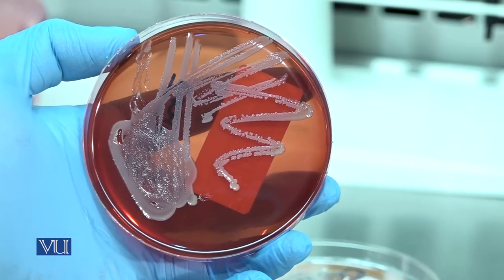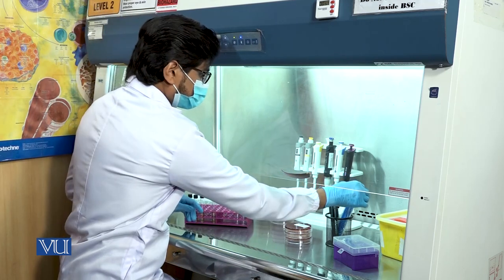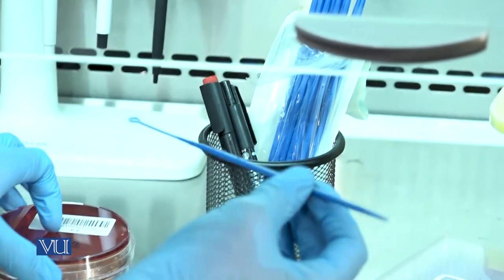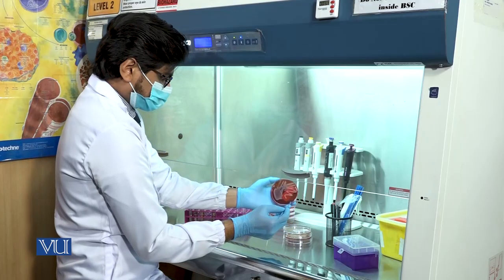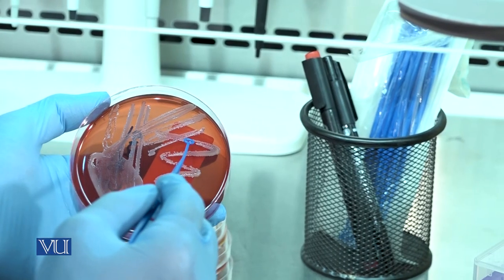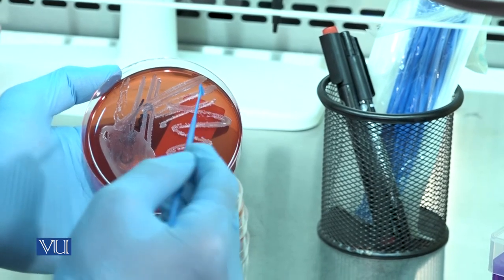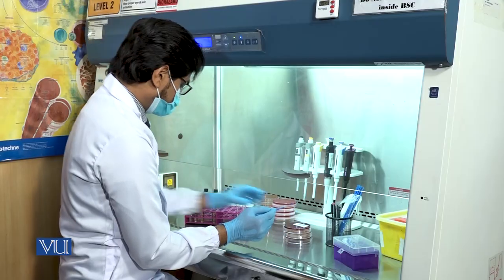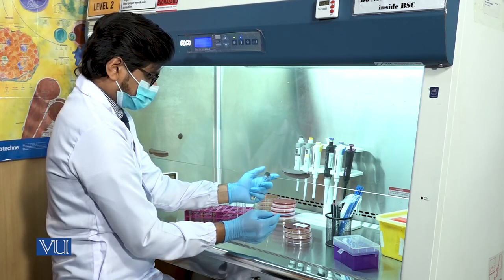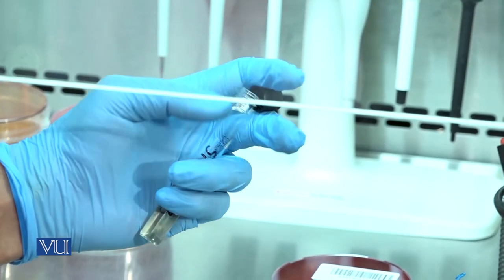Inoculating using disposable inoculating loop. Using a sterile disposable inoculating loop, select a single colony from solid culture media. Open the tube containing liquid media and put the tip of the loop inside and gently spin the loop in the media for 15 to 25 seconds as being shown.